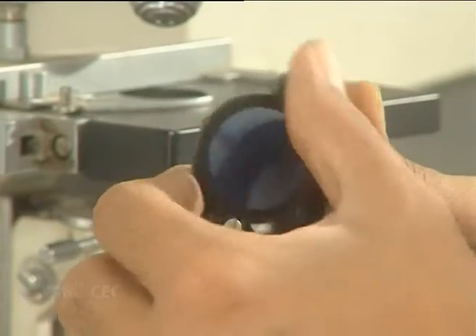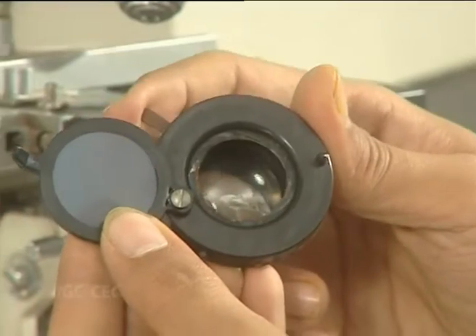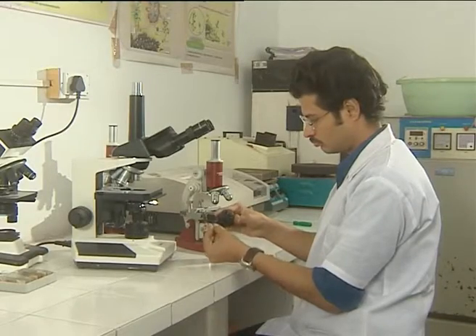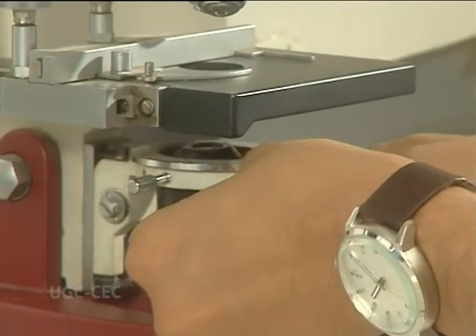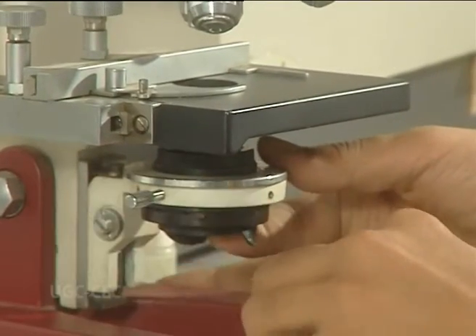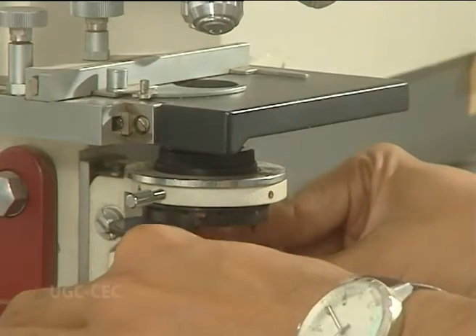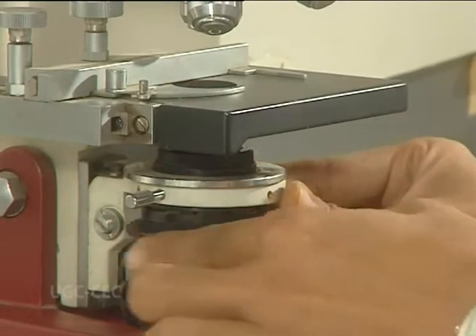A swing-out type filter holder may be fitted above or under the condenser. In some microscopes, the filter holder may not be swing-out type. The filter holder holds detachable filters when required. Condenser centering screws, when present, are used to align the condenser with the objective. A condenser raising knob may be present or the distance may be fixed.